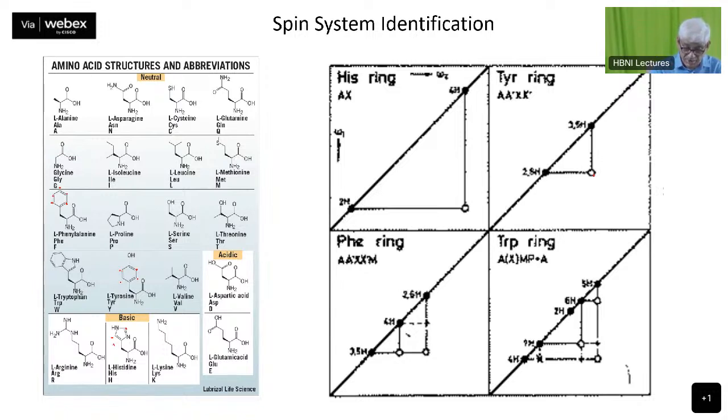Four to 35 you have, but 4 to 26. So that is here. Which is 26? This is 4. 1, 2, 3, 4. So 26. This is 26. Okay, this is 35. You have 4 to 35, which is good here. 4 to 26. Why is it happening like this? Loose connection. Loose connection is connecting this power cable.